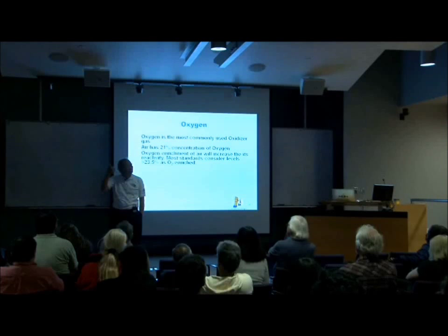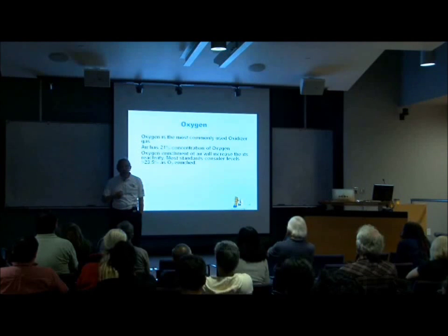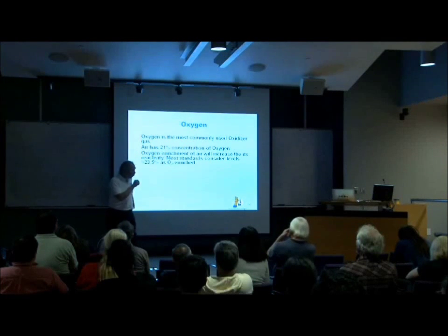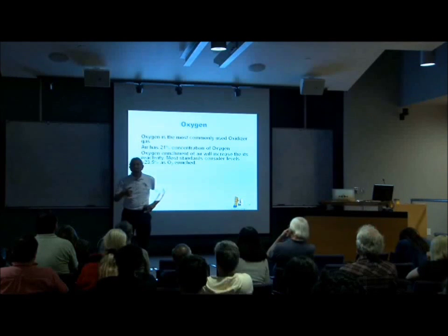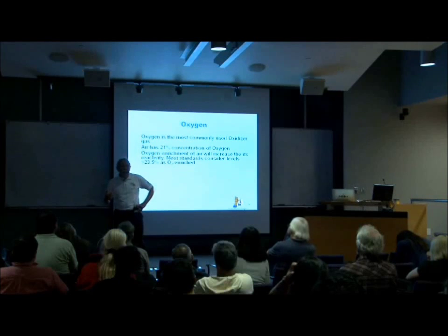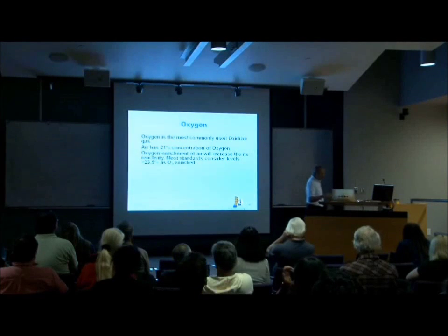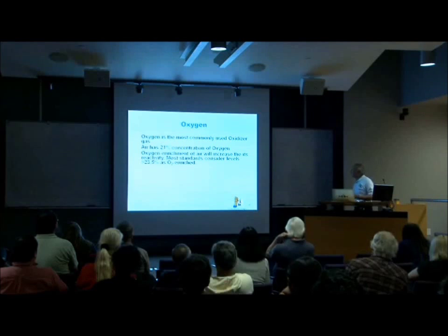Copper, brass, stainless steel are the preferred materials. You'll also have to clean the system. This is what we call oxygen cleaning. You'll see that there's an ASTM procedure on what to do to oxygen clean a system. So not only do you have to design it properly, you need to clean it. Now, there have been a number of regulator explosions because of poor design, or the people using the regulator didn't properly maintain it. They allowed it to become contaminated with another material, and there have been a number of regulators that have exploded because of that. So when you're using oxygen, something as simple as oxygen, you need to be aware that you have to properly clean.